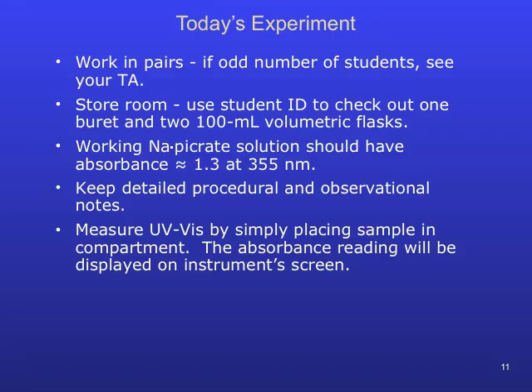All absorbance readings in the UV-Vis spectrometer are taken without using any computer program. Your cuvette containing the aqueous sample is placed in the sample compartment of the spectrometer, and the absorbance reading is displayed on the instrument's screen.